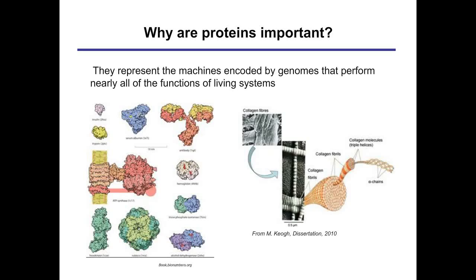So firstly, why are proteins important? This is near and dear to my heart. It's what I've spent most of my life studying. Proteins represent the machines encoded by our genomes, and by all genomes, that perform nearly all of the functions of living systems. They range from quite small sizes for insulin and other types of growth factors, but they can also be quite big, as an example of the collagen fibers, where proteins assemble into larger, higher molecular weight complexes.